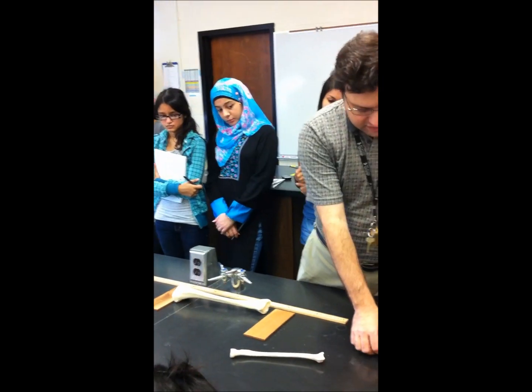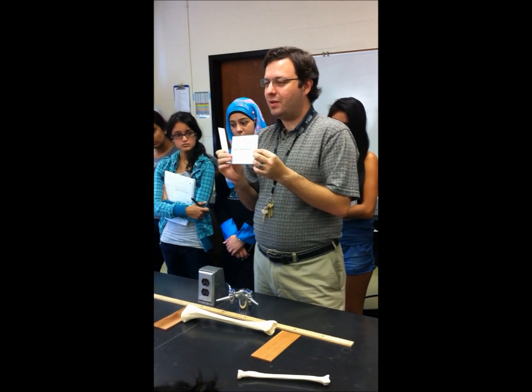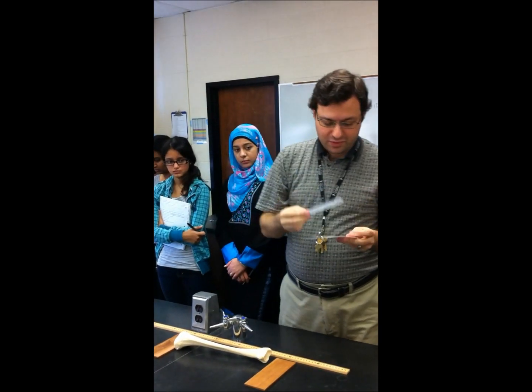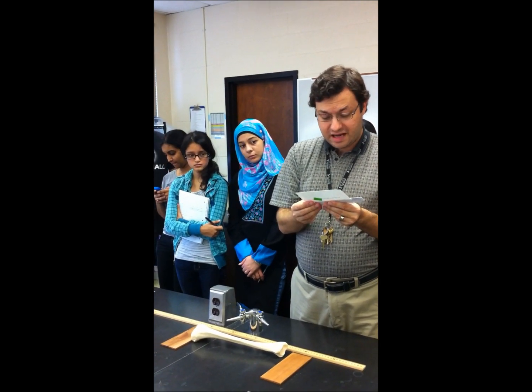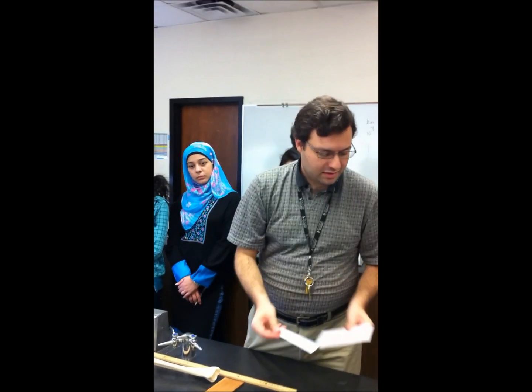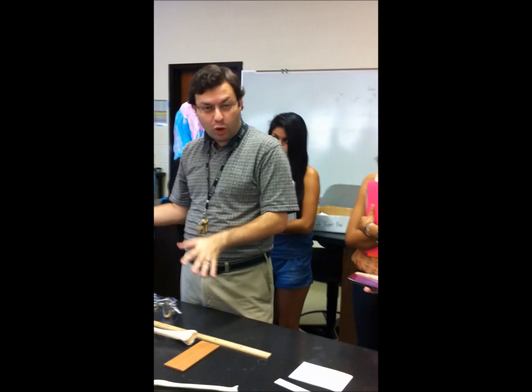The other way that we can do this is, if y'all remember, we had these smaller rulers here. I will tell y'all, this is almost a guaranteed question on there. I don't know why, but it always makes it onto the lab practical. They will give you a line, and then they will ask you to measure it with the smaller ruler here. And then what they usually do is, after you measure it, and you measure it down to the nearest 1/10 of a centimeter, they then ask you to convert the measurement into one of the other lengths. Okay? But up to here, if you want to stop your recordings right there, that's all of lab number 1.